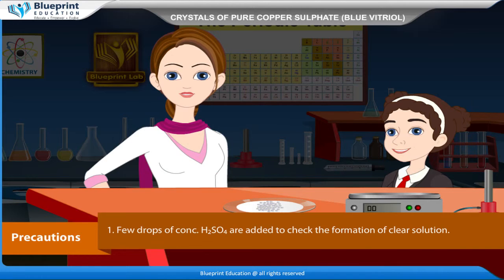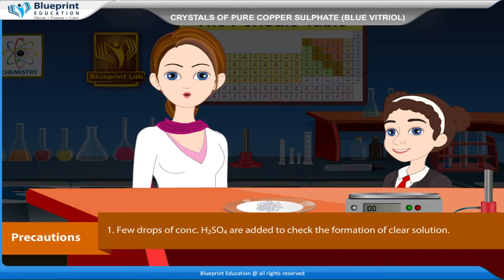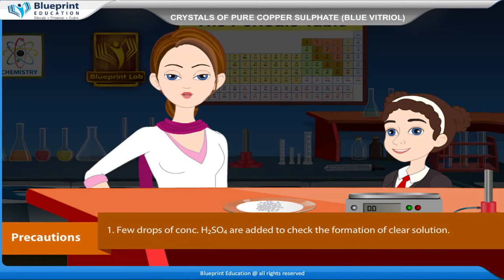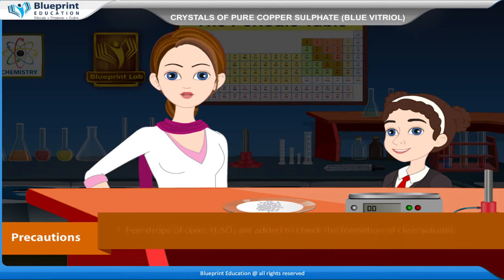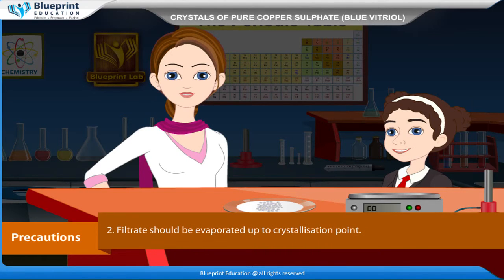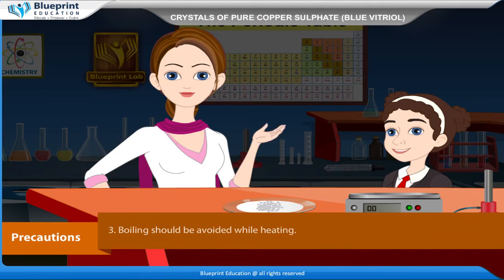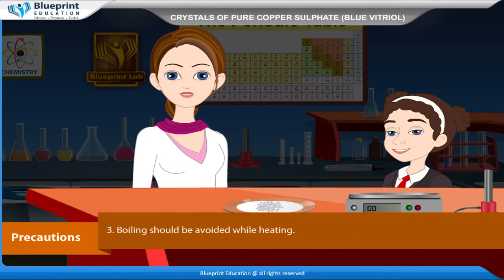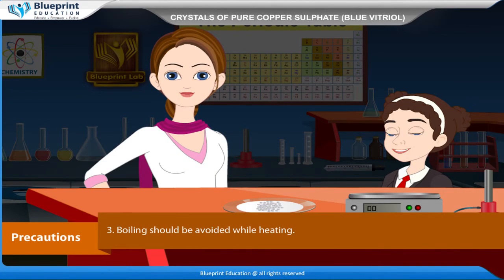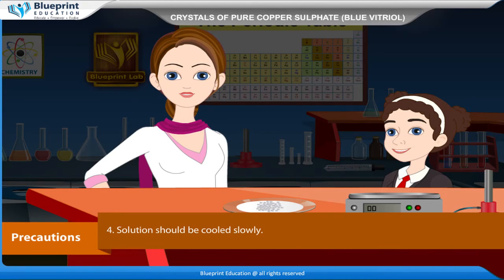Precautions: A few drops of concentrated H2SO4 are added to ensure formation of a clear solution. The filtrate should be evaporated up to the crystallization point. Boiling should be avoided while heating. The solution should be cooled slowly.